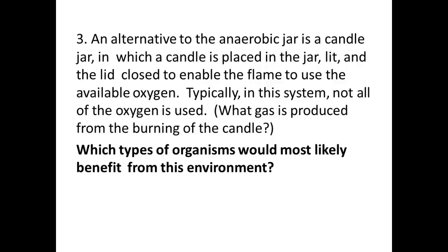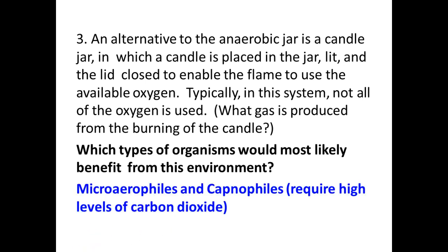Actually, a couple of gases, but anyone know which one can be utilized by organisms? CO2, right? Carbon monoxide is also produced when you burn things. That one's damaging, especially to us. But because of the decrease in the oxygen, microaerophiles would be really happy in this environment.